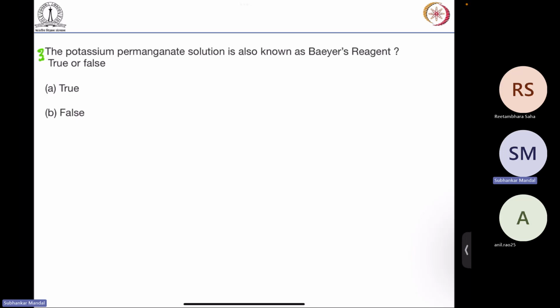Another thing I forgot to mention, which I think we have already discussed, is the Karl Fischer reagent. If some oxidizing agent like manganese oxide or zinc oxide is present, it can react with iodine and give a color change, and then extra Karl Fischer reagent will be consumed for that.